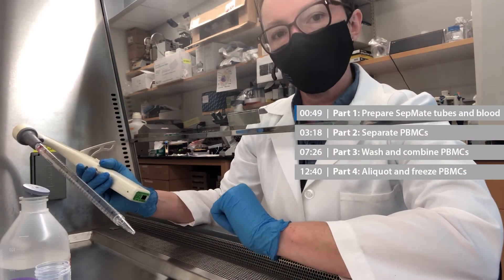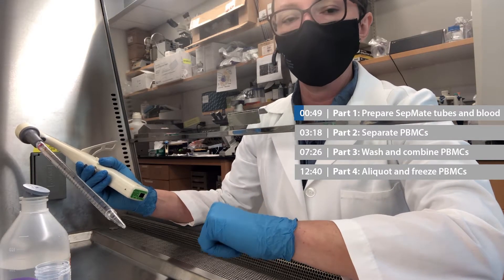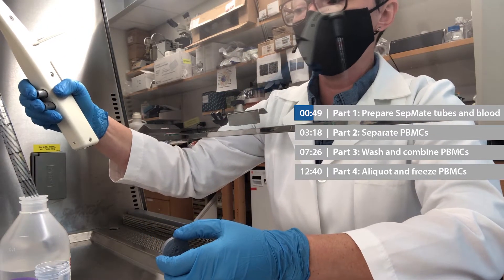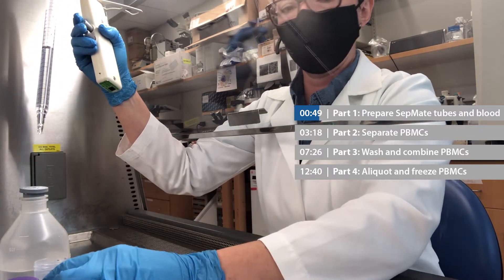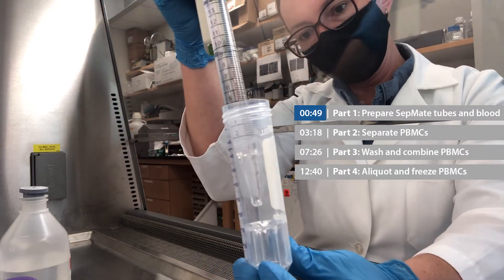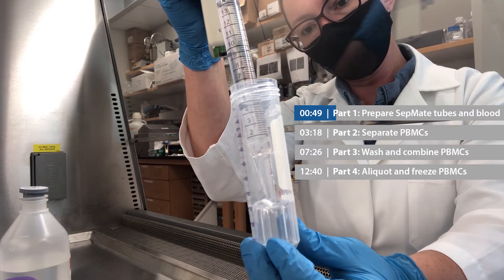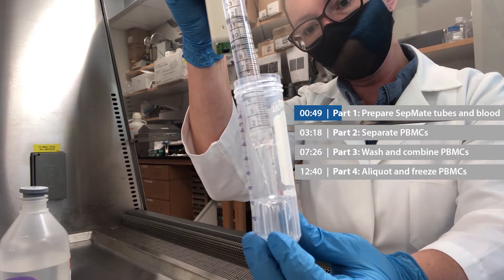The first step is going to be to prepare four SepMate tubes by adding 15 milliliters of lymphoprep to each tube. I'm going to use the graduations on the pipette, not the graduations on the tube. I'm just going to put the tip of the pipette just above the central hole on the SepMate tube and slowly drip the lymphoprep through that hole.